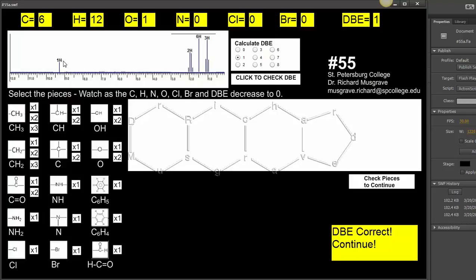and it's not broad. Now if it was broad, you might be thinking it was an OH, maybe a carboxylic acid group, but since it's not, there's no little BR designation here, we can assume that that's a straight peak that's not broad. So we're definitely more looking at an aldehyde grouping.